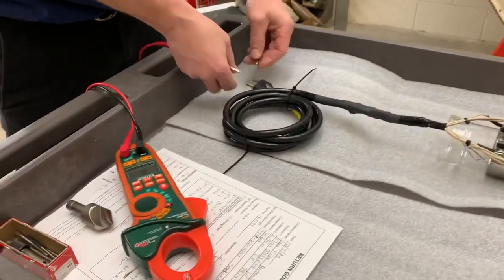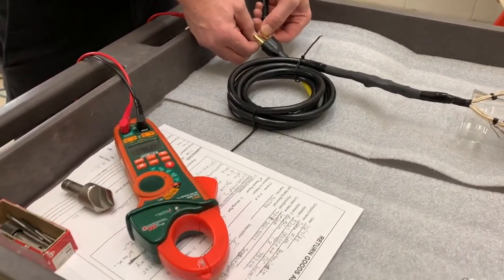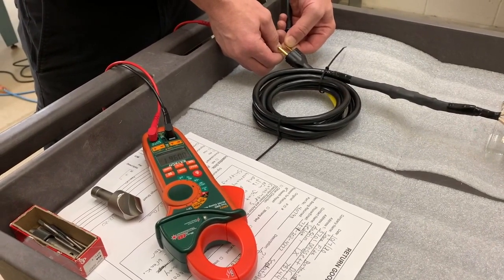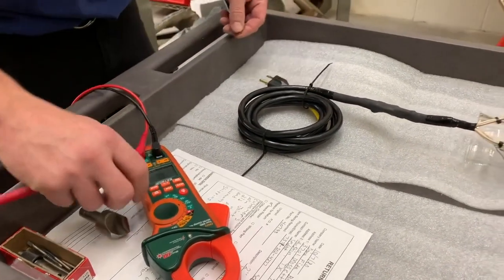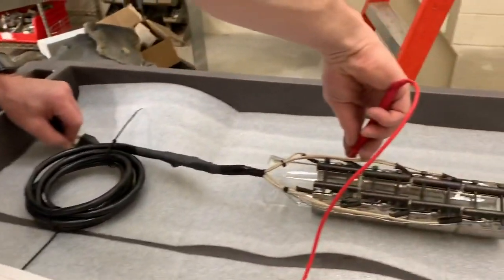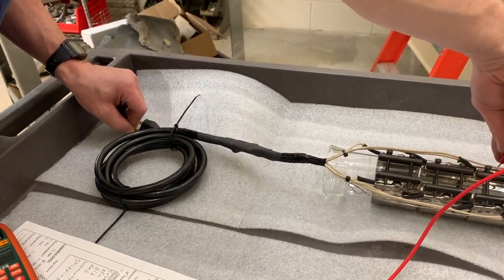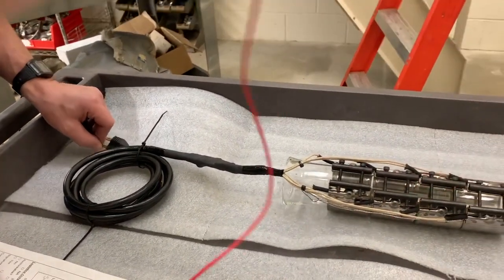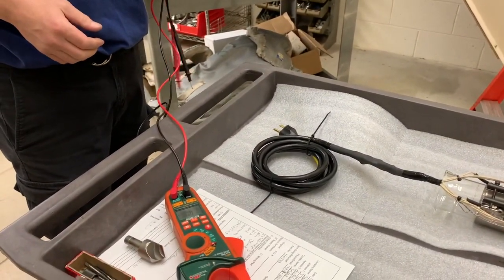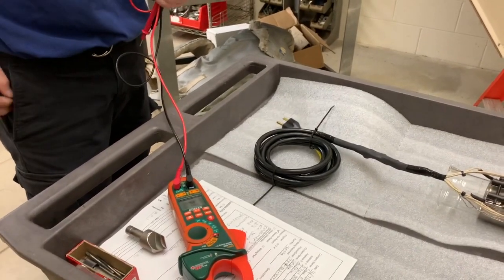We're setting it to ohms and then we're going to measure the resistance, which should be around 9.3 to 9.7 ohms — and we're right at 9.6. Then we can check the continuity of the ground to verify that they all stay connected, and they did. So for the two-inch band heaters, you want to be around that nine and a half ohms.